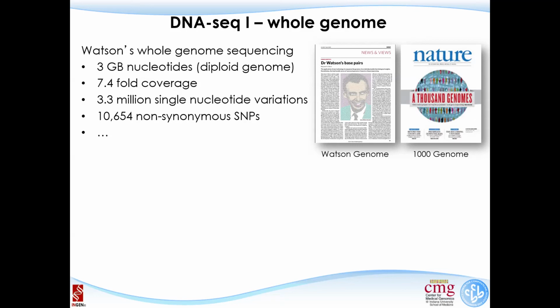So what that means is that we will get into much detail in the later lectures. If we want to call a SNP of an individual's DNA, it's not just because we identify, we say, oh, in this piece of DNA there's one nucleotide different from the reference, we'll call it.